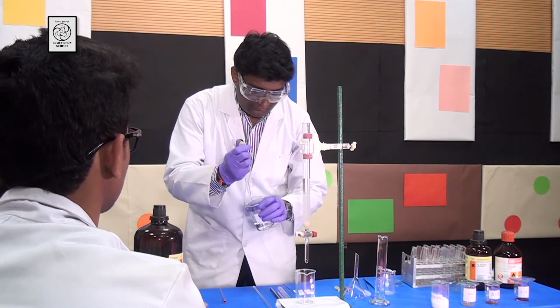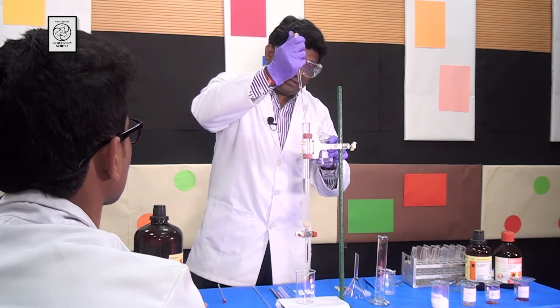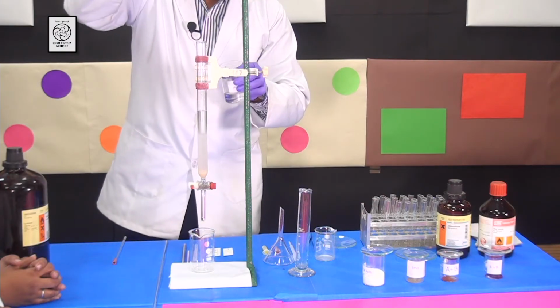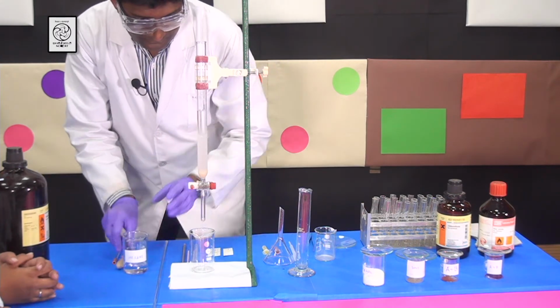Now I will take some of the hexanes and wash. You can see carefully that I am washing the sides of the column so nicely that the silica gel that is stuck to the column sides has been washed inside.